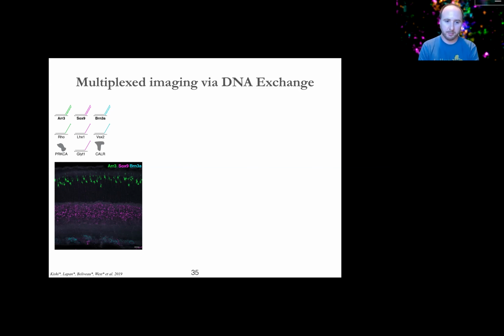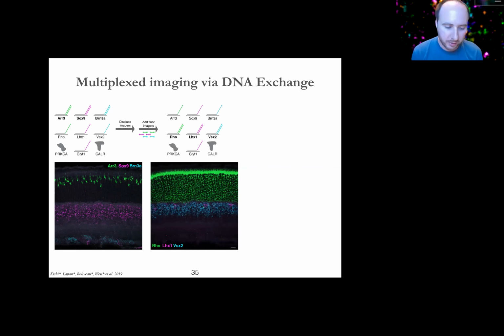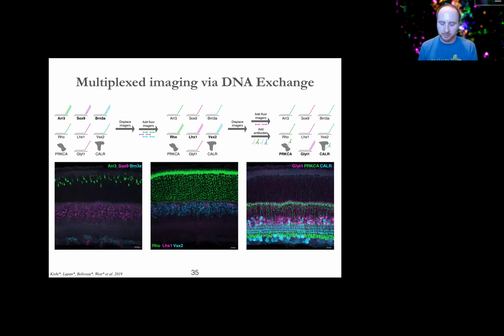So we do that secondary hybridization, we wash, we put it on the confocal and we image, and then we can just shift the solution conditions by introducing formamide. And because these are only 20mers that, in this case, actually have an elevated AT content, they are very rapidly displaced under conditions that do not at all disrupt the base pairing between the FISH probe and the RNA or DNA target. And that's one of the powers of this technique. Then in 5 minutes or so, those are completely gone. We wash again, and then we can add the same 3 fluorescent dyes, but now conjugated to 3 distinct sequences to bind the next 3 targets, and then image those. And they do this again and again and again.